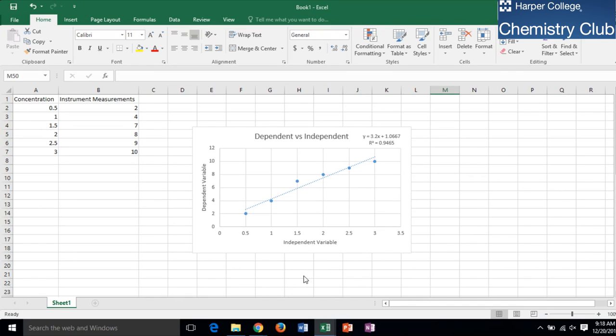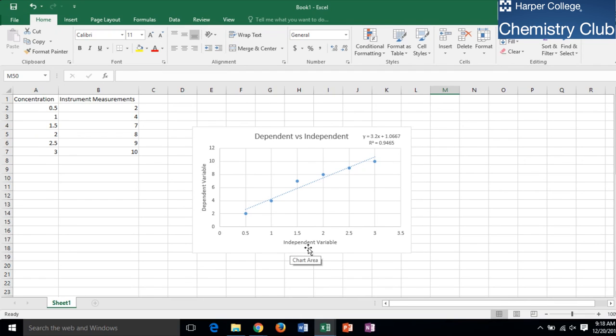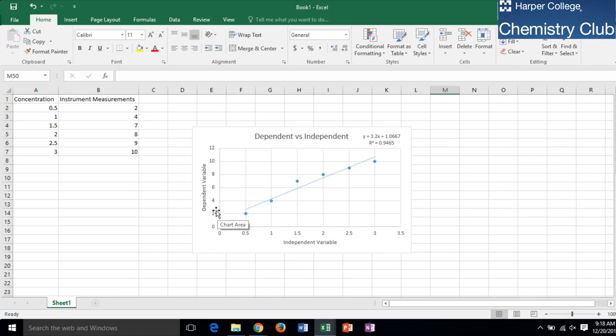A calibration curve is a method of comparing a sample of an unknown value to samples of a known value by graphing the data and creating a linear relationship between the independent and dependent variables. The independent variable is what is being changed and controlled and is graphed along the x-axis. The dependent variable is what is being measured relative to the control changes being made and is graphed along the y-axis.